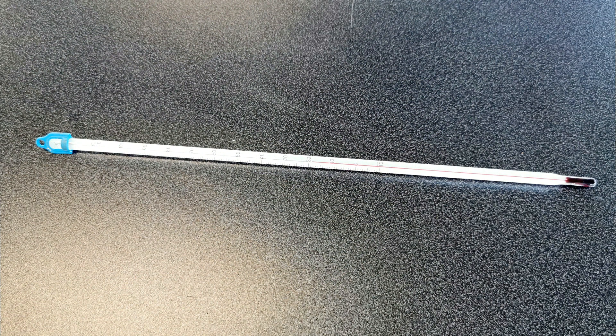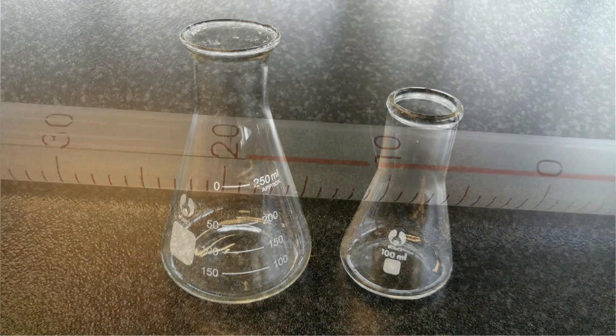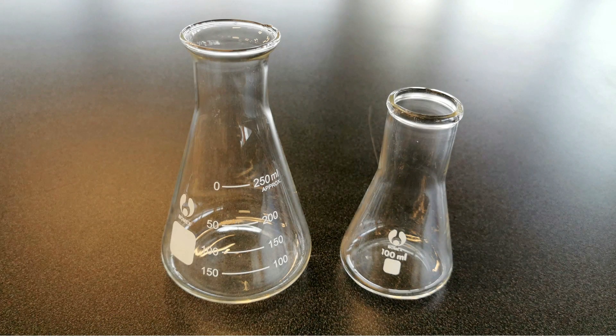A thermometer — a lot of the time when you're doing a practical you might want to measure the temperature. We tend to use alcohol thermometers now, not mercury thermometers anymore. Alcohol thermometers are safer; thermometers are very thin pieces of glass and quite easy to break, so you don't want mercury being spilled out.